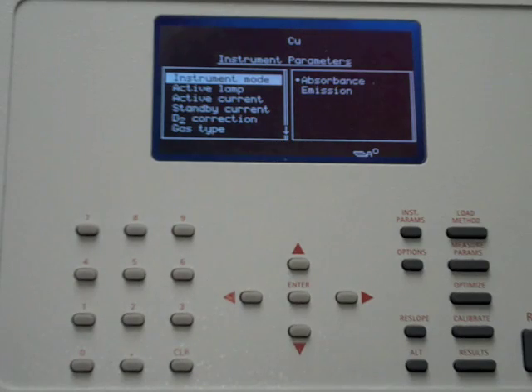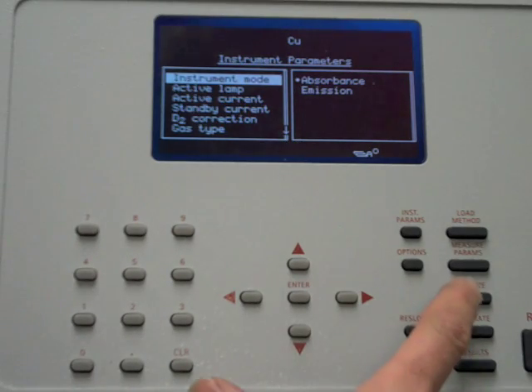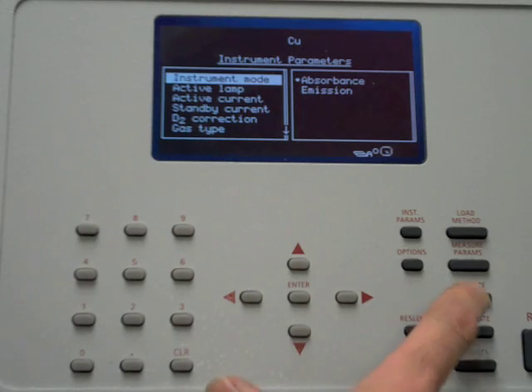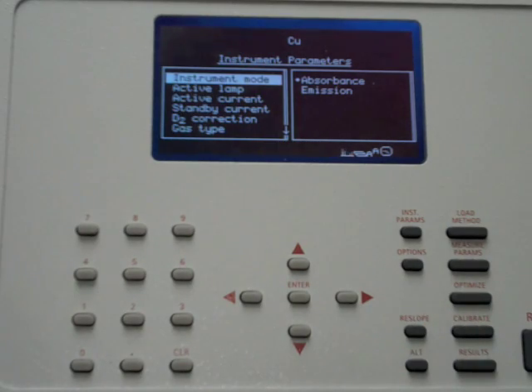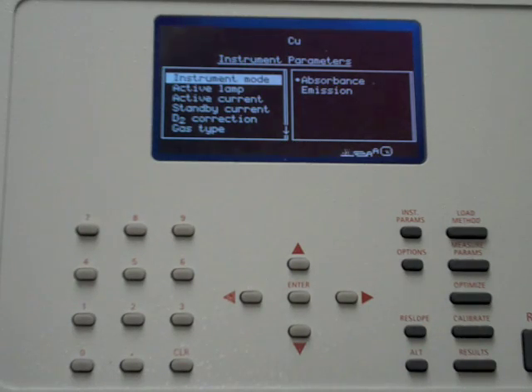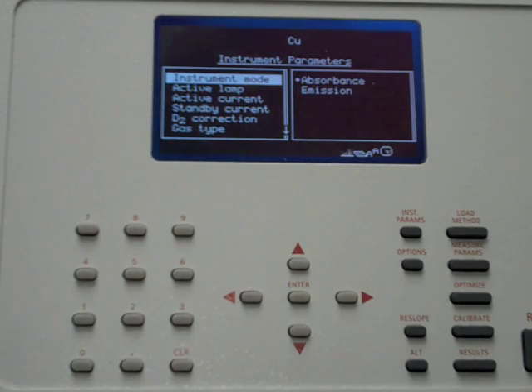At this point, turn on the lamp by pressing the optimize button. The instrument takes a minute while the lamp warms up. Eventually, you will see a broad line move across the screen to indicate that the detector is responding to the light from the hollow cathode lamp.